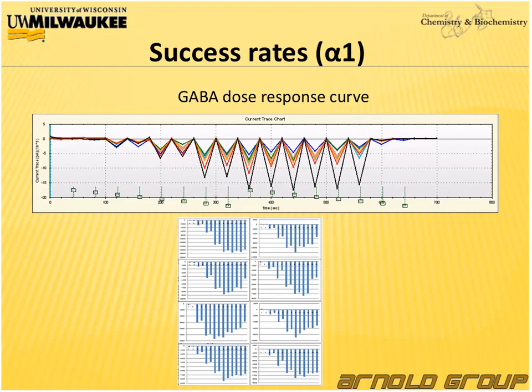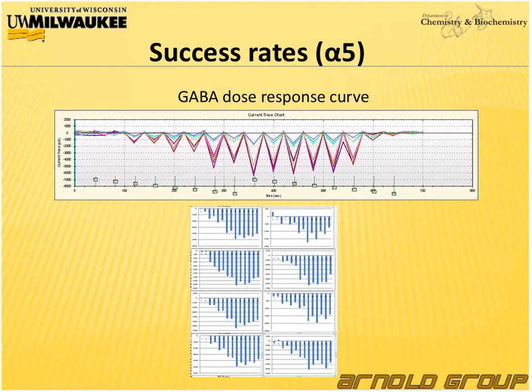I just depict here an Excel slide where you can see that the dose response of each of the ensembles is the same, although the absolute response will be different. I also want to show you another example where it's maybe a little bit clearer. We can see here that we have a high response in some ensembles, and in other ensembles the response is significantly smaller. But all of them show a very nice dose-response relationship.